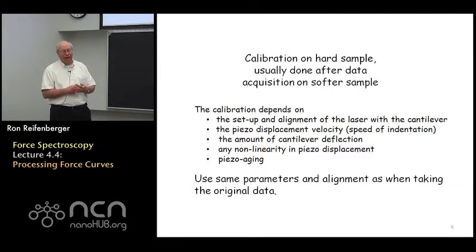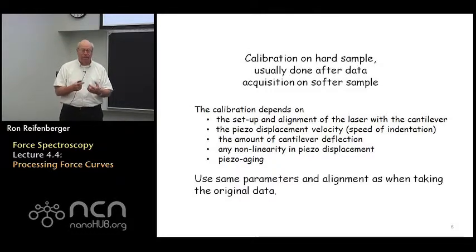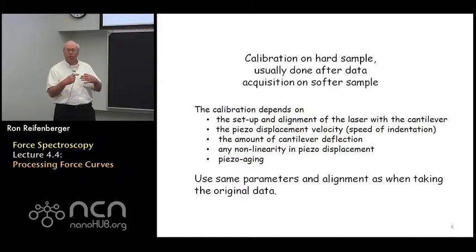It depends on a variety of things, right? It depends on the speed of the indentation, so that's the piezo displacement. It depends on whether you're doing that slow or fast, so the calibration could vary slightly with that parameter. The calibration could also depend on the amount of cantilever deflection, so it depends if you're indenting just a little bit or a lot.